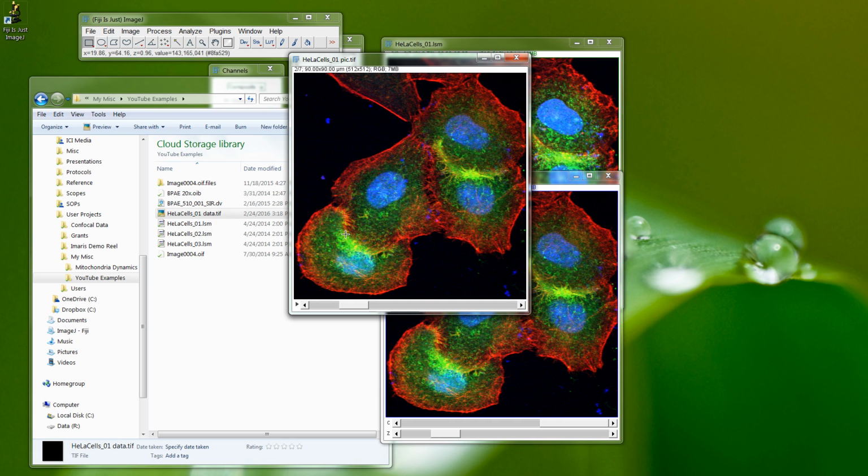Not to be confused with spectral channels of red, green and blue. These are just the colours that the screen needs to make up the picture, so it's a little bit convoluted in that regard, but this is more for the monitors and displays than it is actual raw data. Although it's made from raw data, it's difficult to think of it that way, because you don't want to go backwards from an RGB to a data format, because you're going to lose a lot and you're going to make some inferences about the wrong data in the wrong channels.